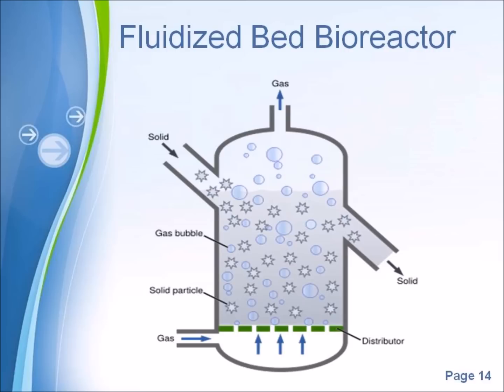As the smaller particles have the lowest settling velocity, the bed arranges itself so that the smaller particles may be in the region of the highest porosity and the lowest linear velocity. The tower fermenter, developed for the continuous production of beer, is based upon these general principles.